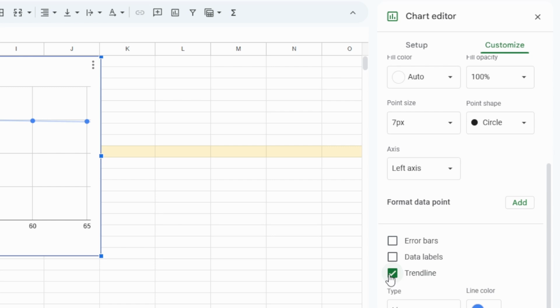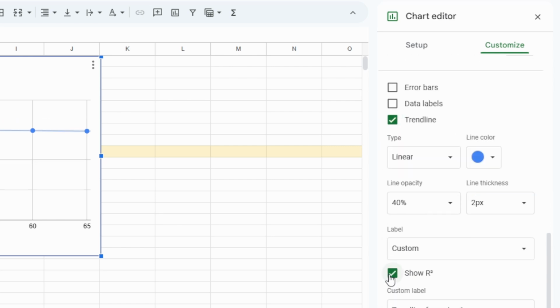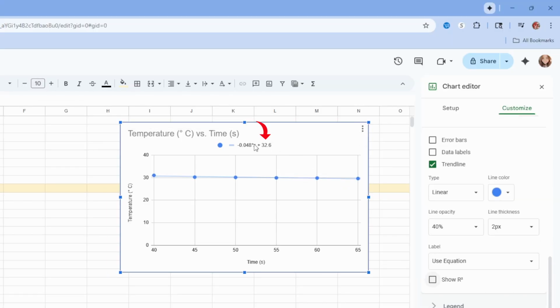And to do this, we need to show the equation of the line. Your y-intercept, the number at the end, is the point in which the y-axis is crossed, and this is the temperature you will use as your final for this example trial run. To find the change in temperature, you would subtract the final temperature minus the initial temperature.